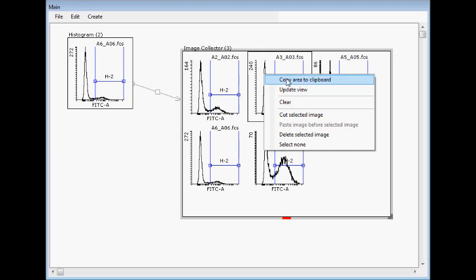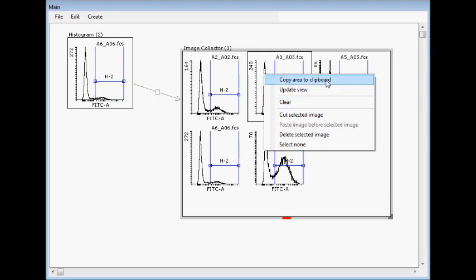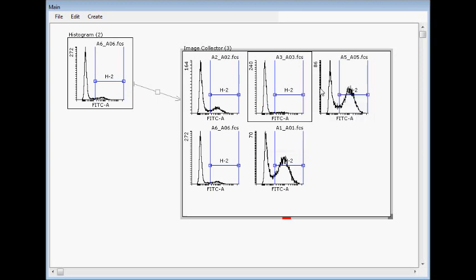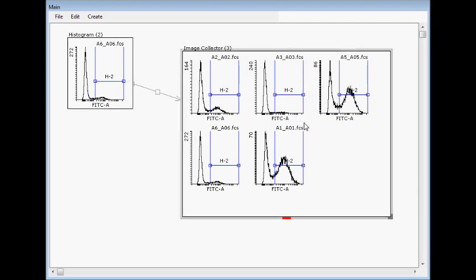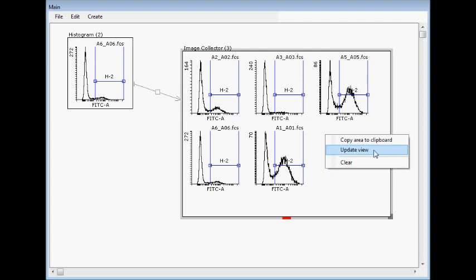And then you can copy the whole area to clipboard or clear it. Update view is that it takes the image from here. Normally it automatically does that, but this is mostly for overlay histograms which doesn't automatically send the image.